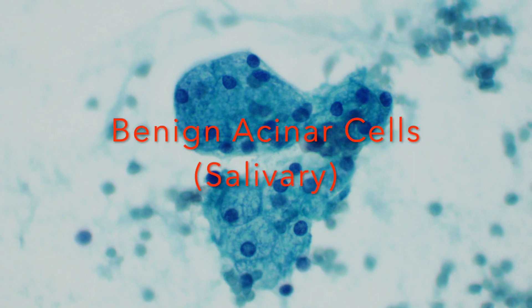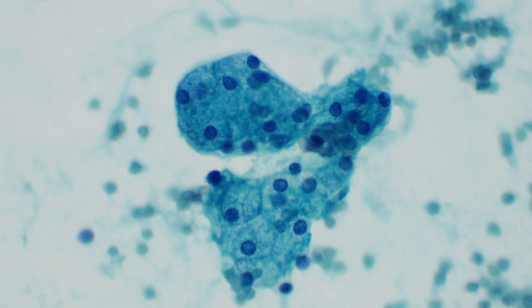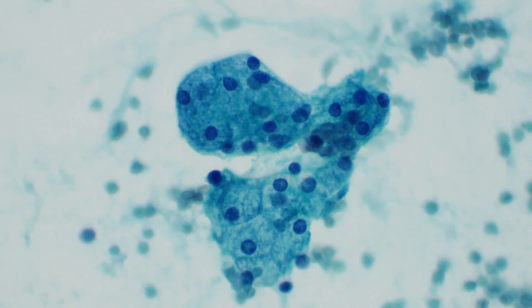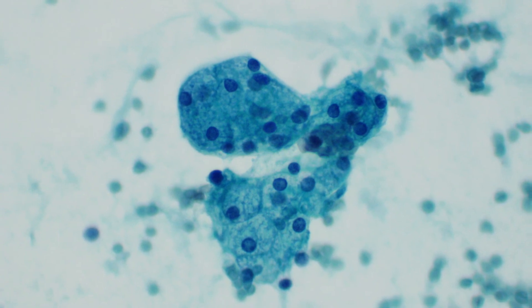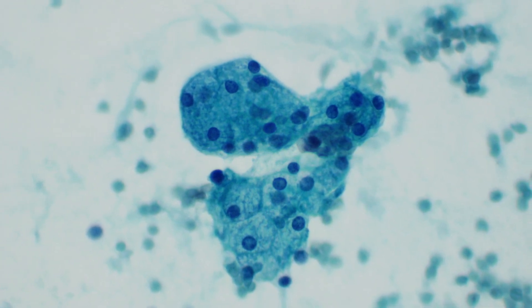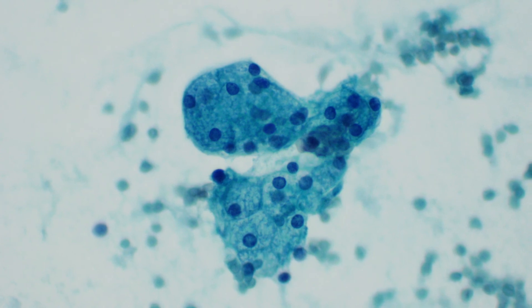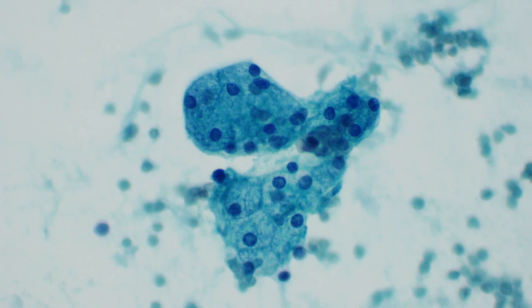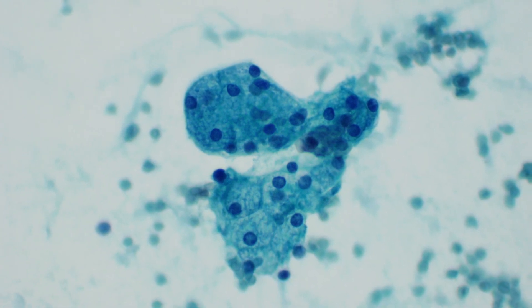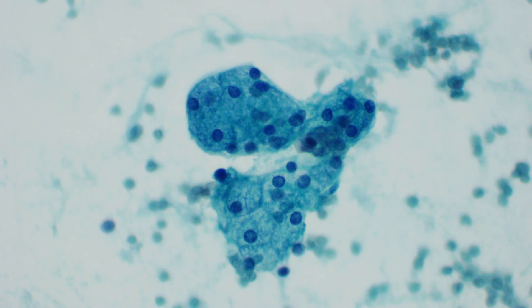One type of cell that we would typically see in the salivary gland are acinar cells. Acinar cells play an important role in the production of saliva. When we see them on cytology they tend to form groups that we refer to as clusters of grapes. These are just the normal cells that we would see if we were to sample one of the salivary glands.